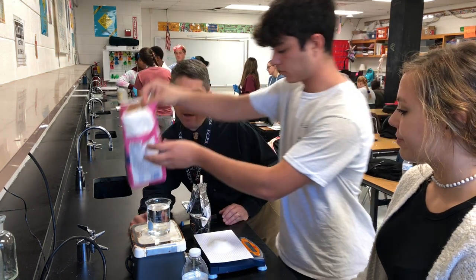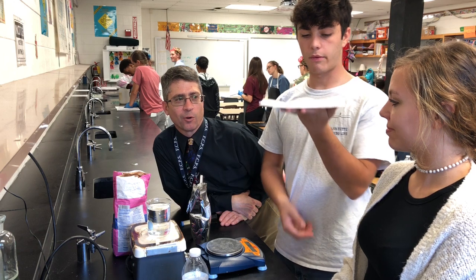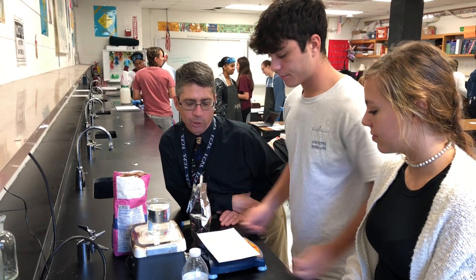Yes. Wow. The procedure is glycolysis. Okay, I'll take your word for it. I'm not familiar with that. That's a lot of sugar in a soft drink. All right, so then we have to dilute that in the water.